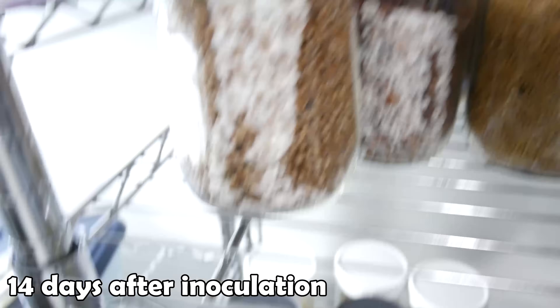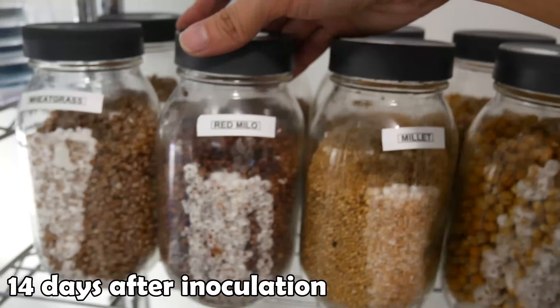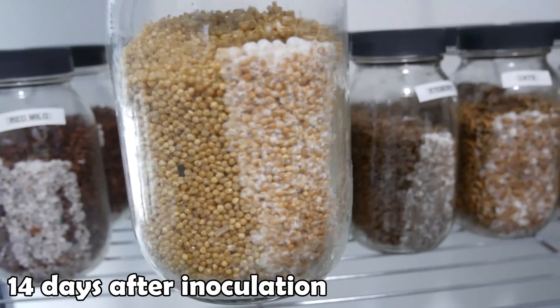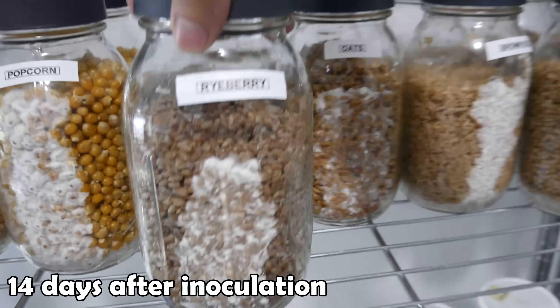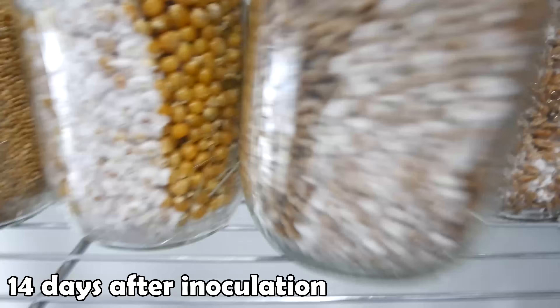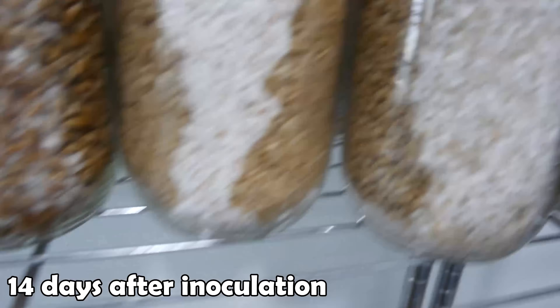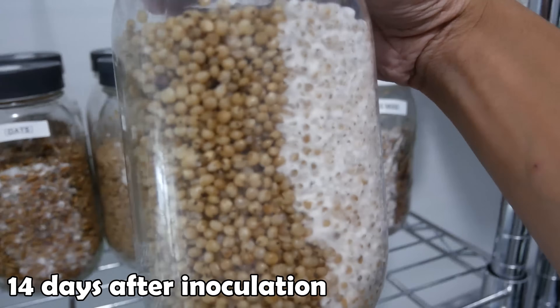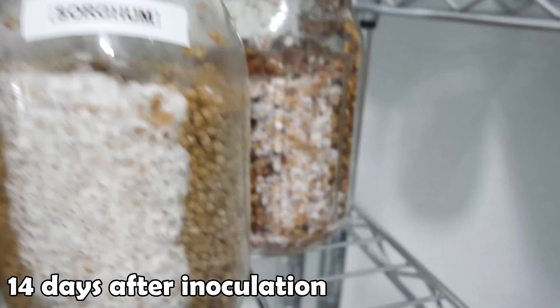Ten days later — 14 days total after inoculation, here's how the jars are looking. At this point the mycelium has started to adapt to their grains and they're starting to take off. They take off with very fuzzy colonization — this is called tomentose mycelium. As they go, they're going to start to shift form and stretch out to find more nutrients, and this type of stretchy growth is called rhizomorphic mycelium.